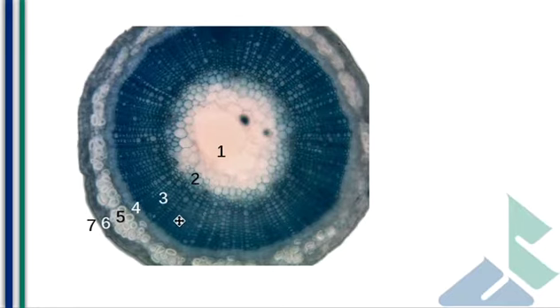And then we go into our phloem, as we will most certainly have. And then supportive fibers, in this case sclerenchyma. Sclerenchyma are not living at functional maturity, comparing to the collenchyma, which are living at functional maturity. And then we have a small layer of cortex. This would be potentially photosynthetic. And then the epidermis.